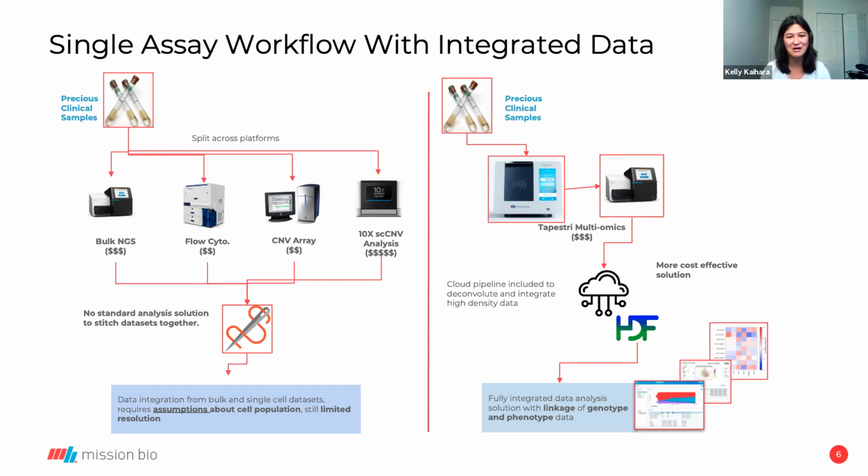To tackle all of that data, we've now switched to H5 files, which can handle information across all of these different parameters. We've worked really hard in the past couple of years to create software tools and data analysis packages to analyze these data, making it easier for the customer to very quickly get very beautiful illustrations and visualizations of what's happening across all of these different readouts. Next slide.